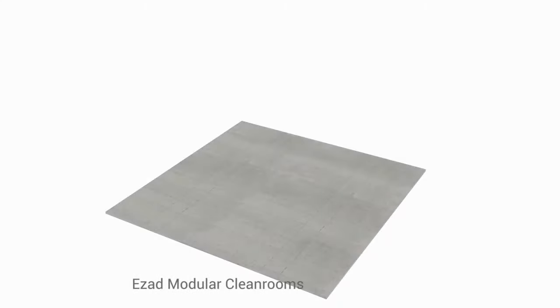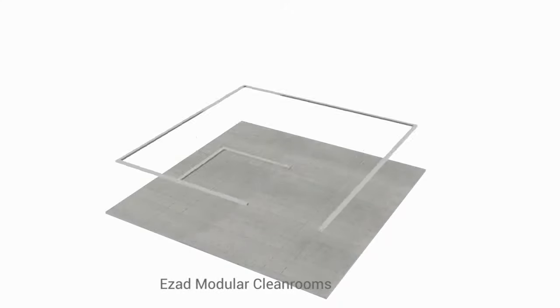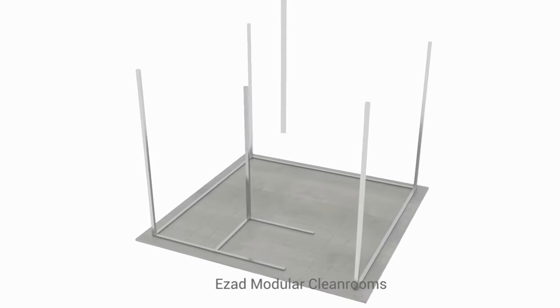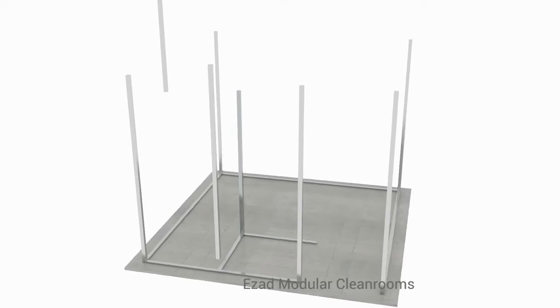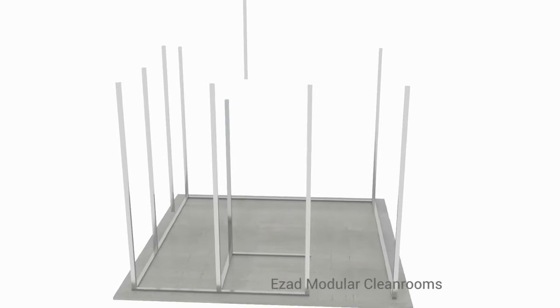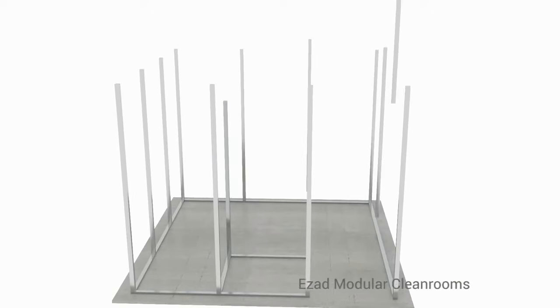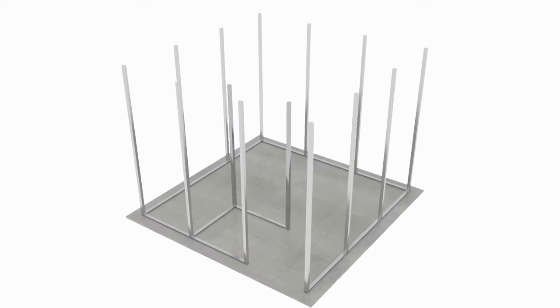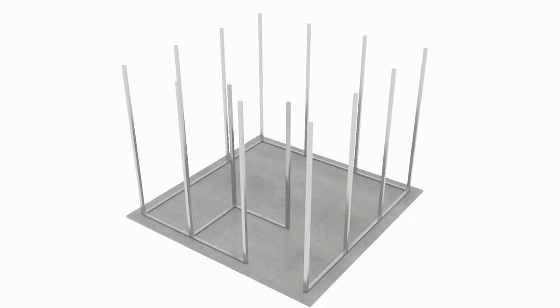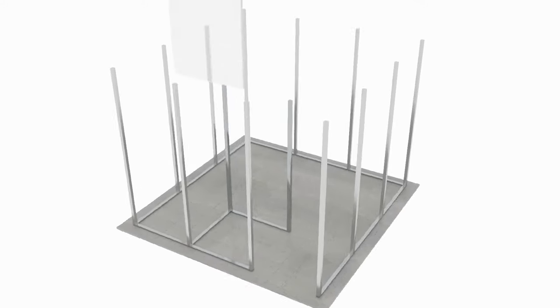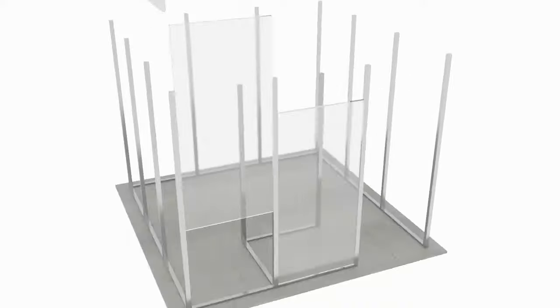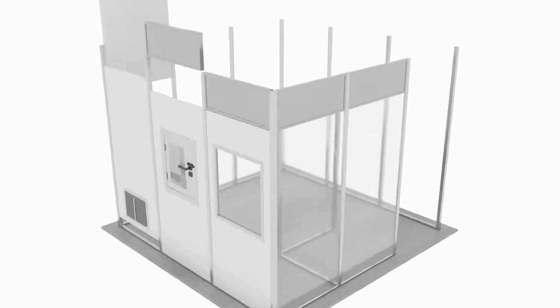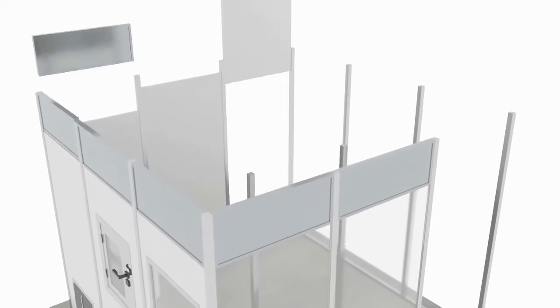EZAD Cleanrooms designs and builds custom modular cleanrooms for ISO 5 to ISO 8 applications. Modular cleanrooms by EZAD offer the same benefits of a traditional cleanroom, but are faster and more affordable to install and are easily expanded.